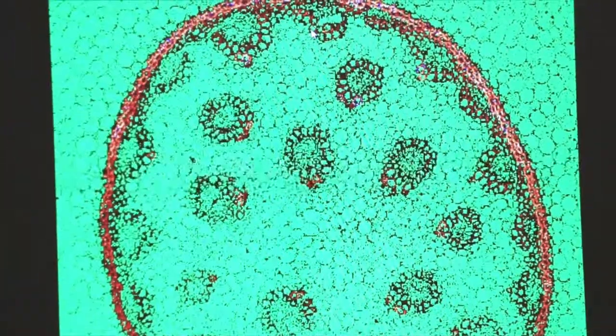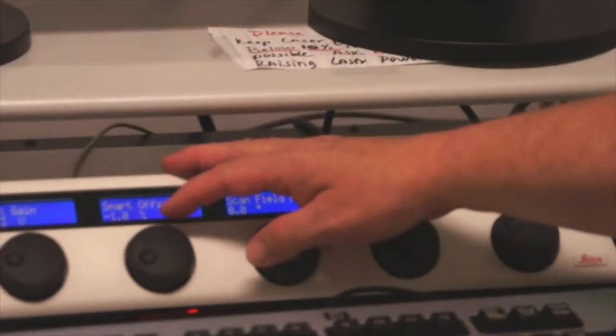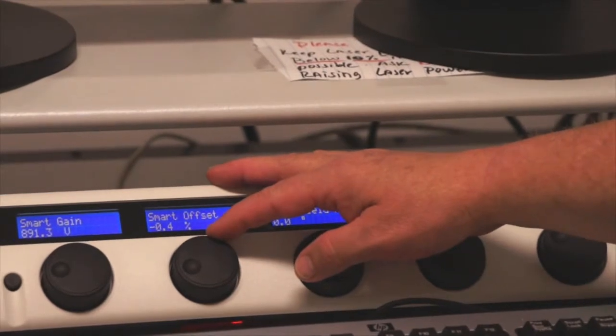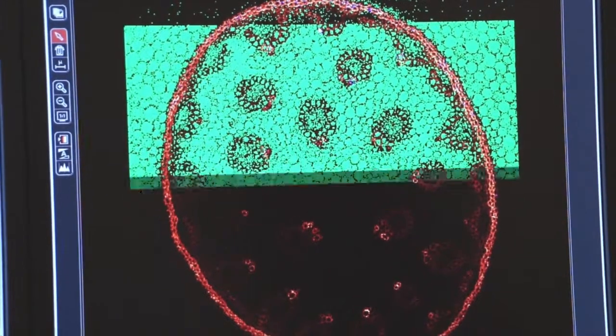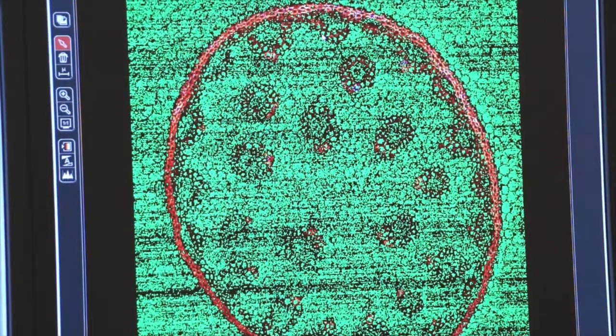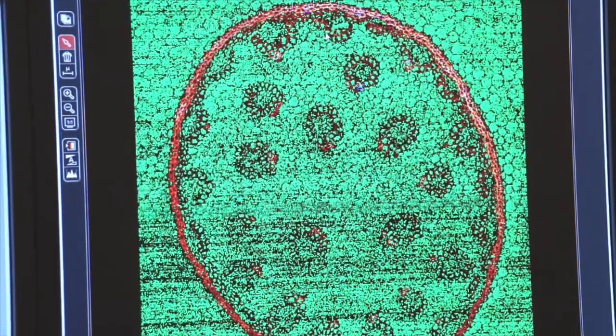That's the proper setting for my gain. For offset, I want to have as few green pixels as possible just before it goes completely dark. So I adjust my offset until I have just a few green pixels and you can see there, that's the proper setting for my offset.